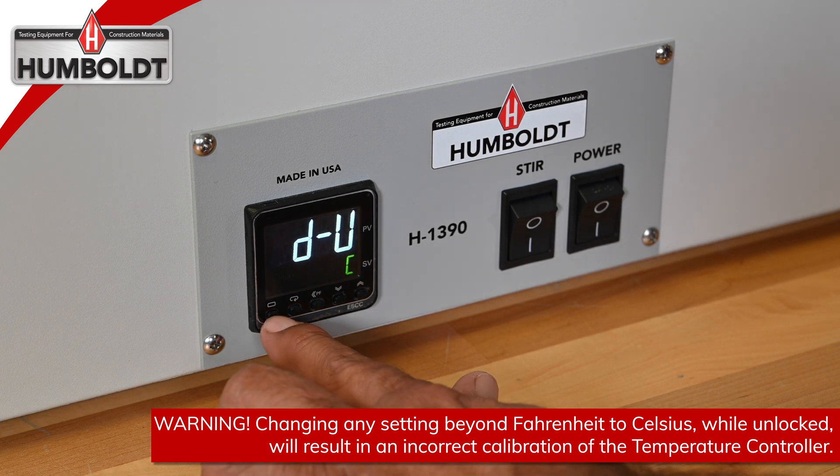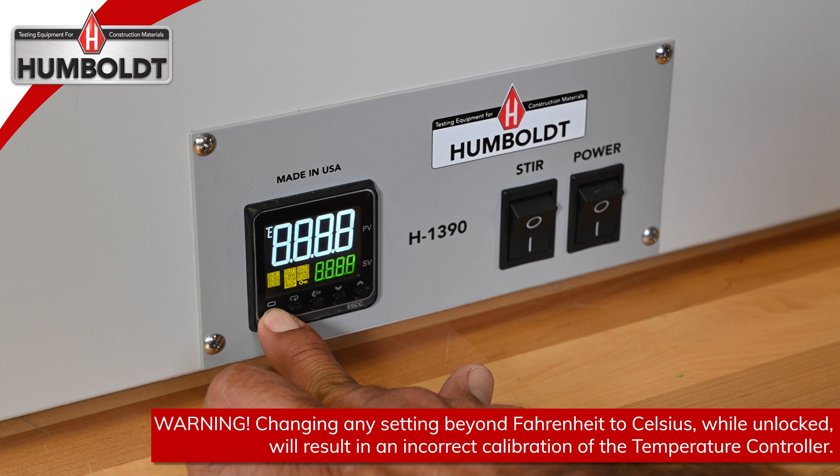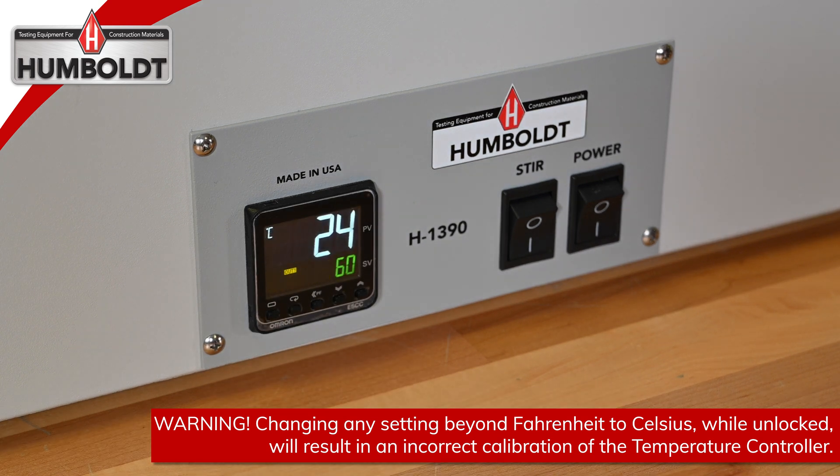Finally, press the first button on the left for 3 seconds to save and exit. The unit of measurement has been successfully changed and the controller must now be locked again.